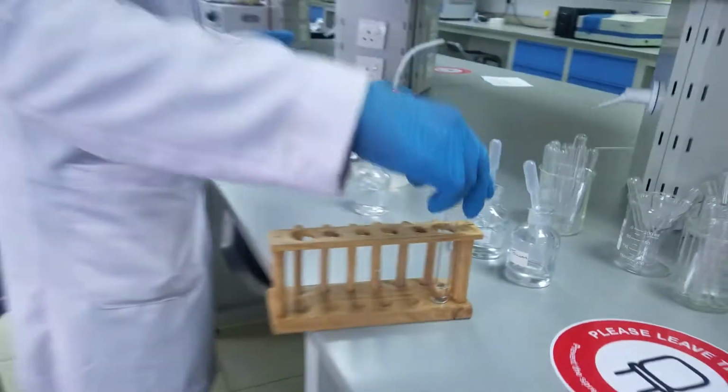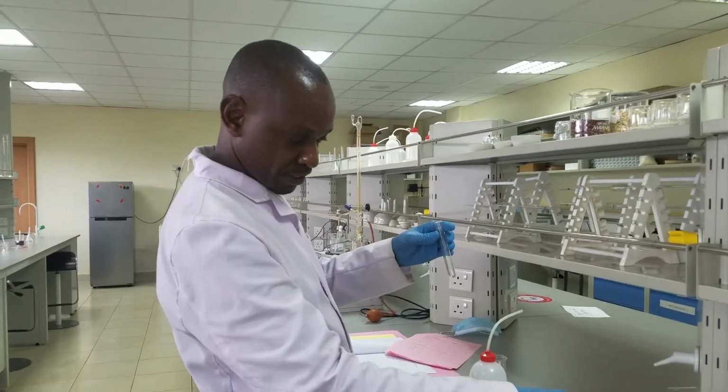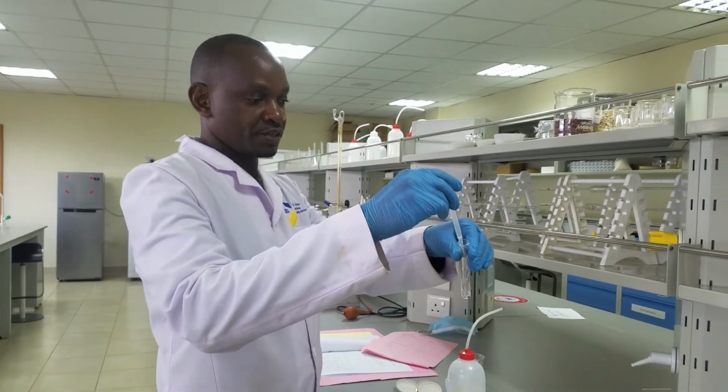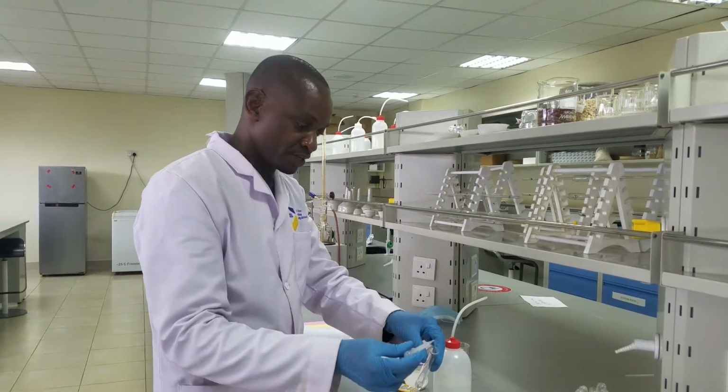Okay. The second experiment is now I'm using toluene. And I'll still repeat the same experiment like that and add in a few drops of DCM.